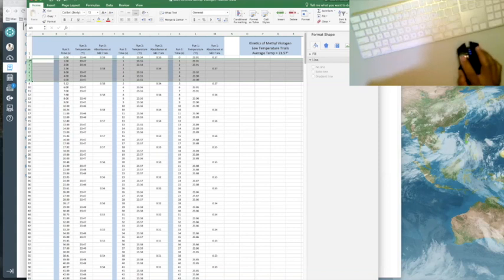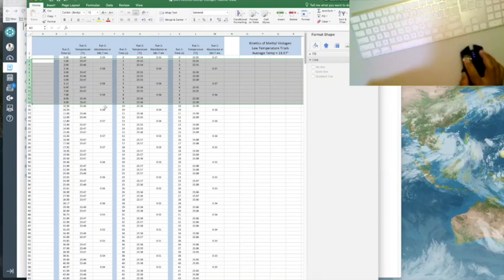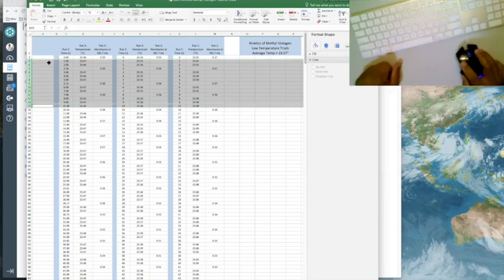So I'm going to delete from here, and suppose I want to keep the data at 10 seconds. Well, there's no absorbance there, so you don't want to select that because that just leaves you a blank. You need to include the 10 seconds run and then delete everything between 0 and 10.24.